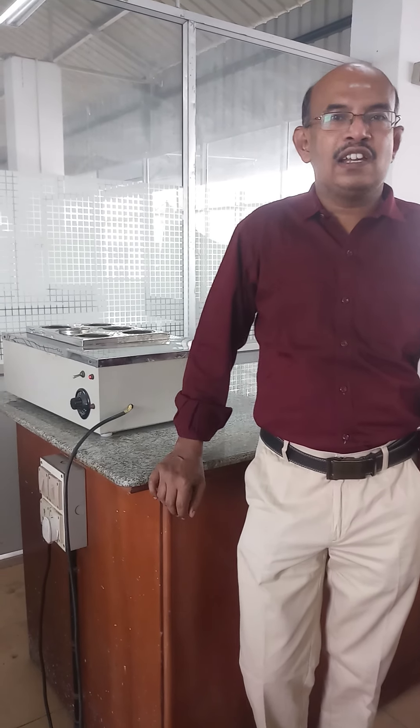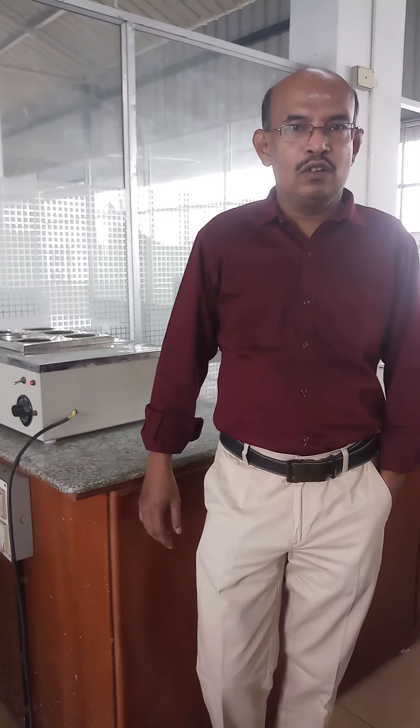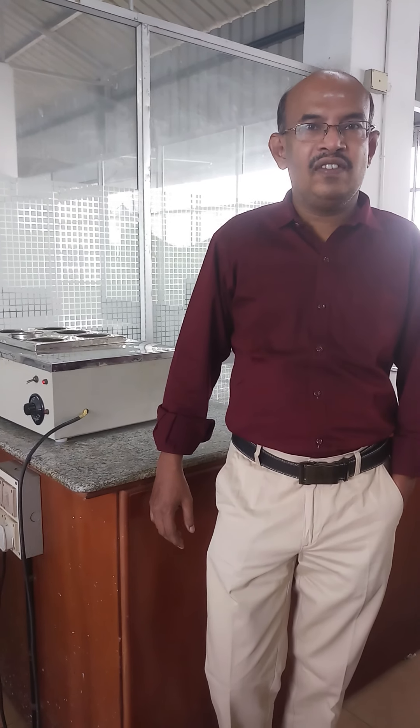We are going to dye the viscose rayon with reactive dye. Since viscose rayon is a cellulosic material, the dyes which are used for cotton can also be used to dye viscose. Today we are going to dye the viscose rayon in the form of a lea with hot brand reactive dye.